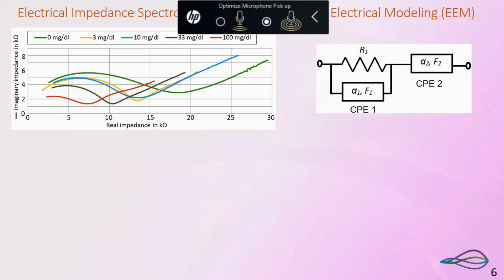So we will propose the electrical equivalent model, as we are electrical engineers or sensor engineers. We will go for the electrical parameters, and this is the part where we model the sensor and the interface and the whole electrochemical system. I will go through what is CPE. I hope most of the people do not know about the CPE. I will go into the detail of CPE.